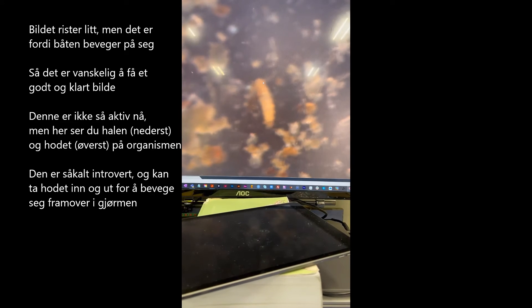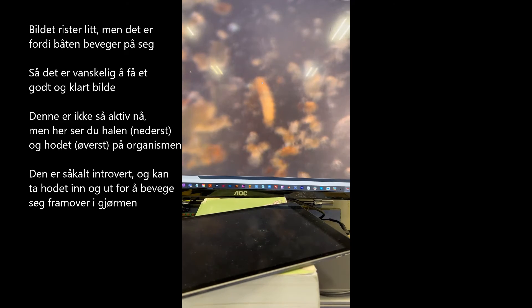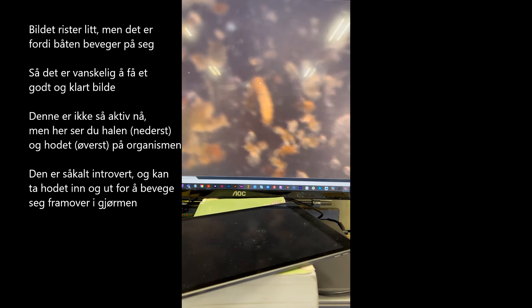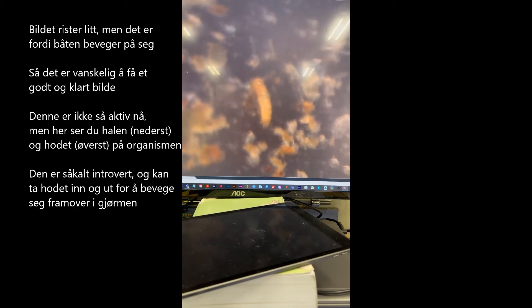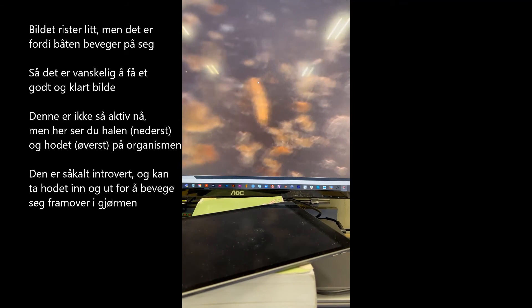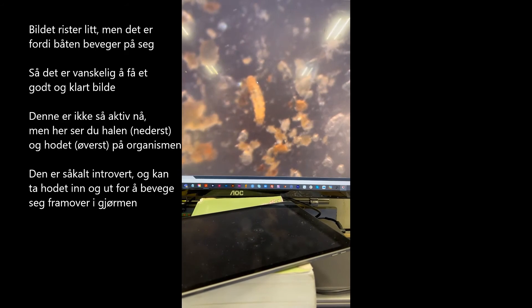The image is so shaky because the ship is moving, so it's hard to get a nice clear picture.